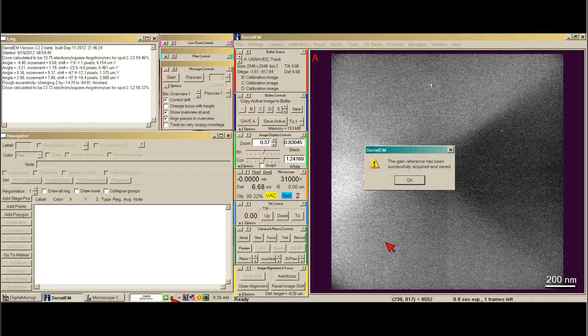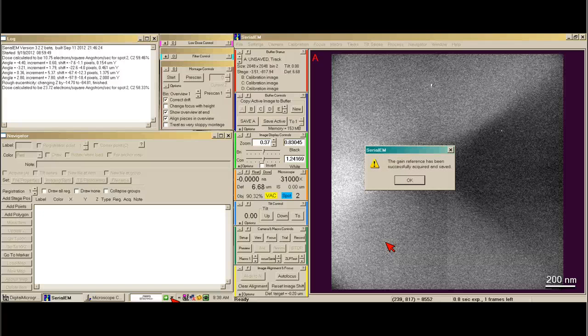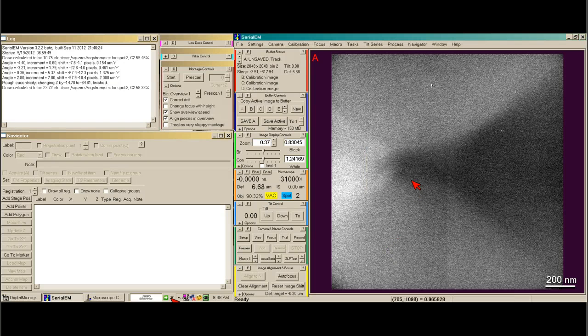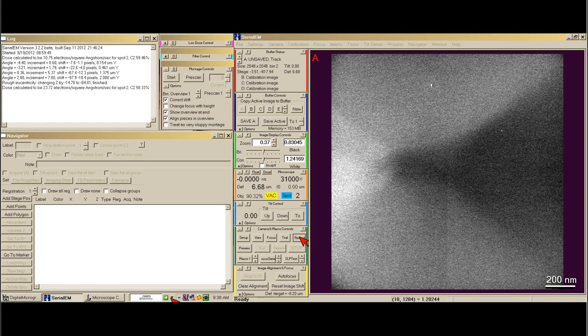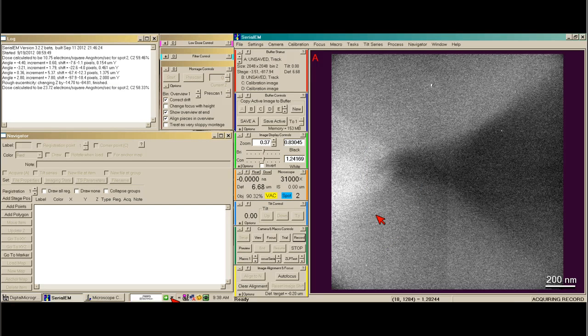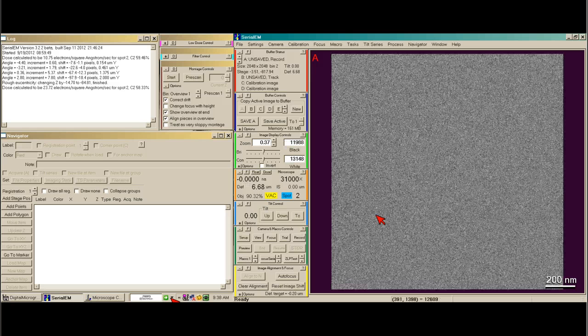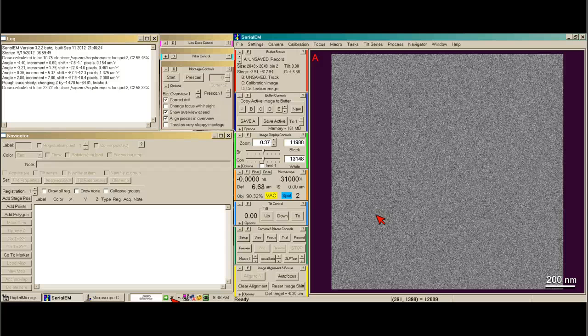Okay, now that the gain reference is finished, we can just say OK. And I often just take a single record image to see how my image looks to make sure I have a nice gray background.